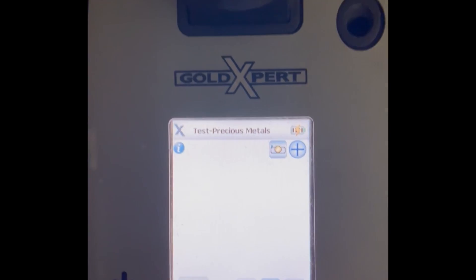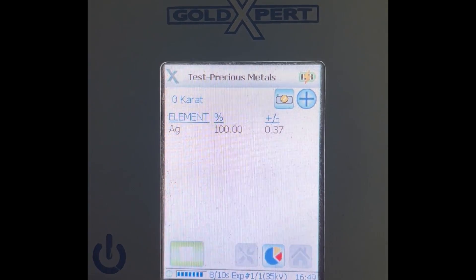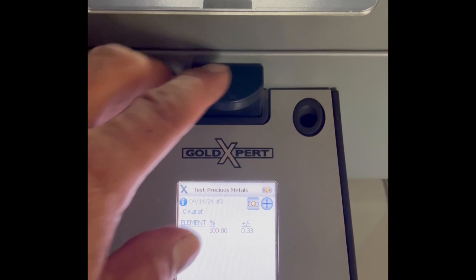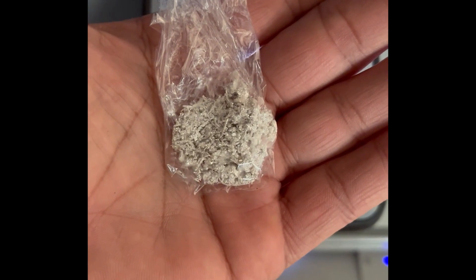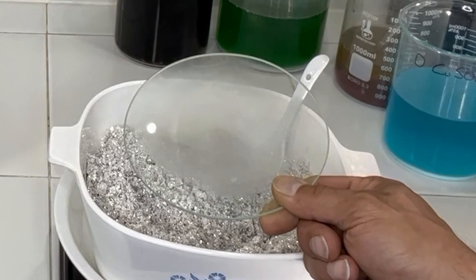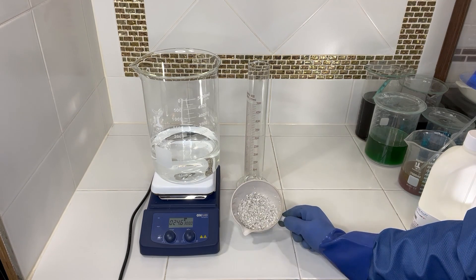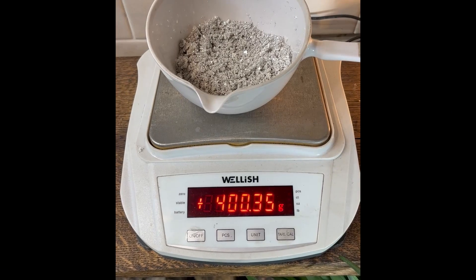Keep in mind when you read the XRF result, standard deviation accounts for error, but the fact that we only see silver and don't pick up any other metals is a real good sign that this is three nines fine silver. The XRF says 99%+ purity on the samples that we took. I will take a few more samples because I'm sure there is a little bit of copper in here — we'll see that when we dissolve this in nitric acid if we get a little blue color. We're going to weigh out 400 grams of silver and measure out 400 milliliters of nitric acid.